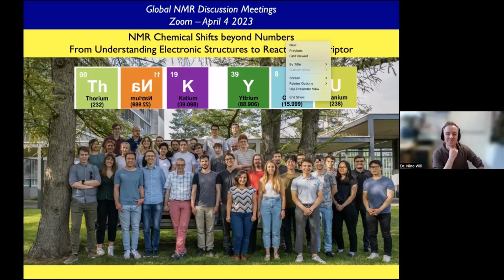And there's another question by Eddie Dib. Dear Professor Copéret, thanks for the great talk. May you comment on the Al location in non-equivalent crystallographic T sites in zeolites and its impact on zeolite reactivity? Does this location matter, or is it more an accessibility and diffusion issue?